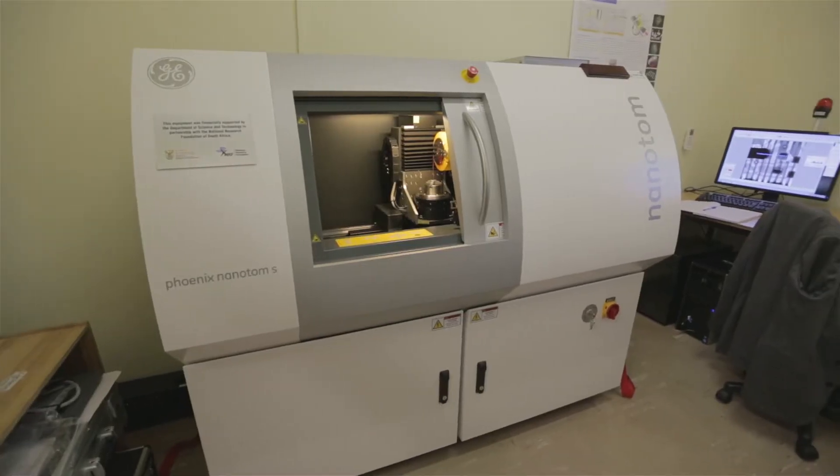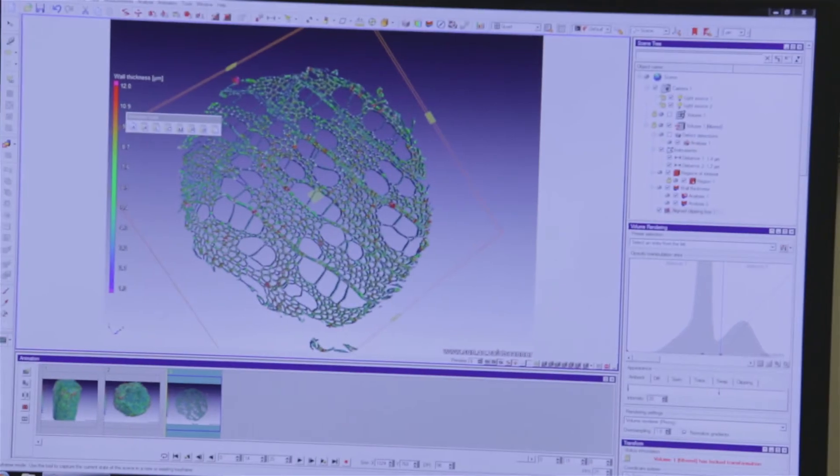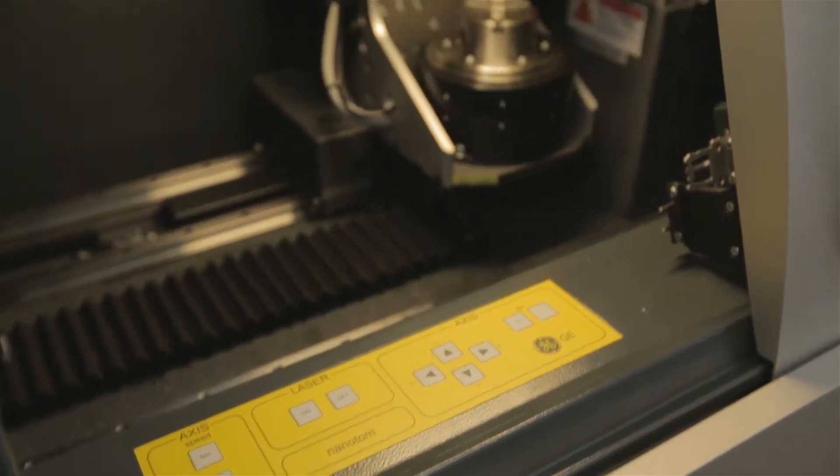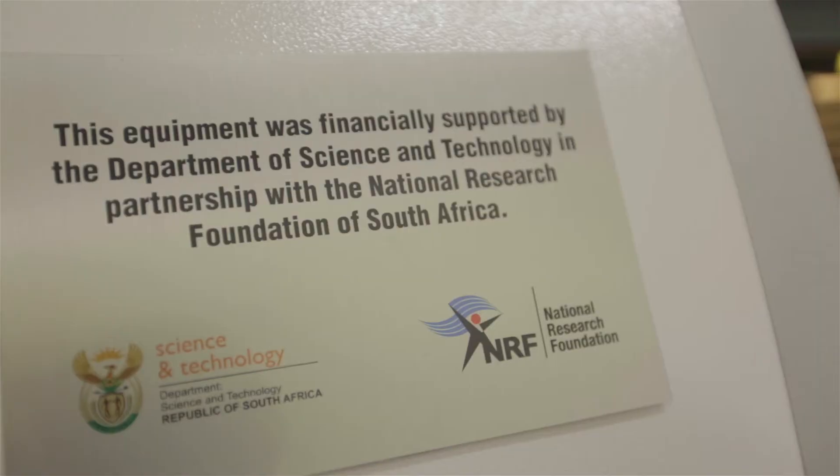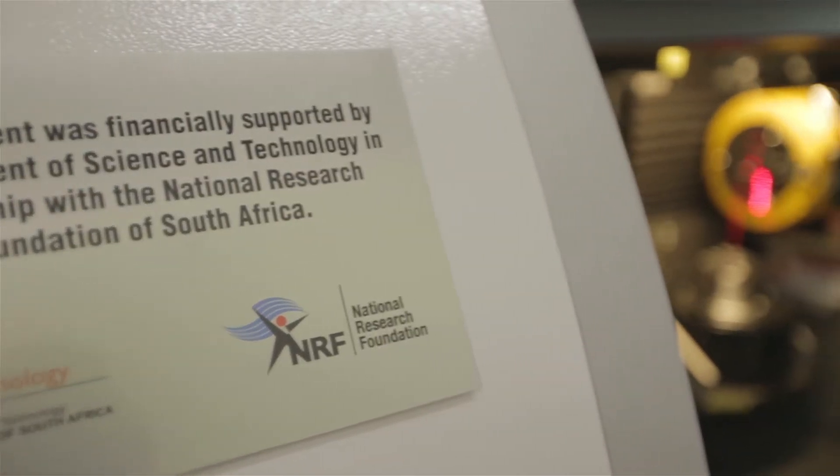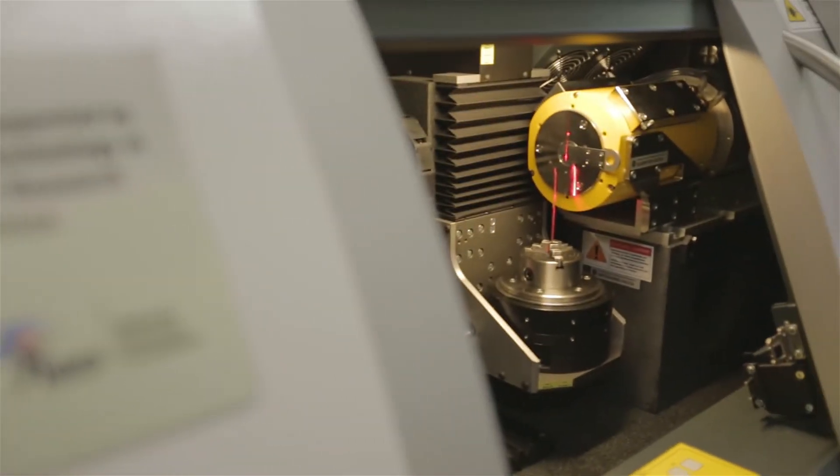This is the newest addition to our analytical facility, which we are doing x-ray imaging in 2D and 3D. We do visualization of the inside of objects non-destructively for the last two and a half years as a service to academics and companies in the region. And since this is now the latest addition, the highest resolution x-ray microscope in Africa, we are very excited to be launching this instrument.